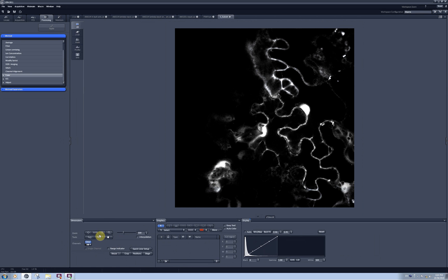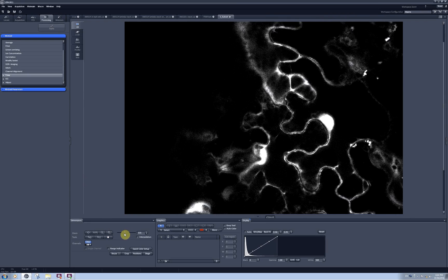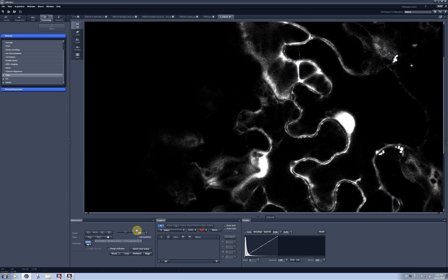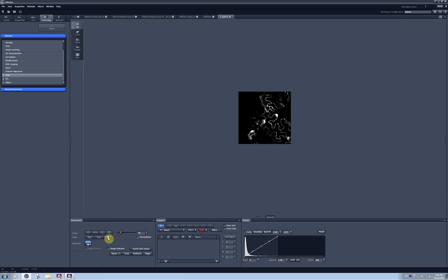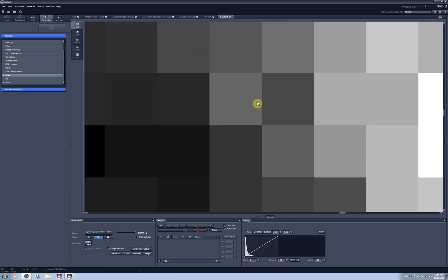The size of the image will depend on the resolution of your scanning. You can zoom in and out using these tools or by scrolling the scroll bar. Alternatively, you can zoom in on a selected area of most interest — select and then draw a rectangle on your image and you will get a zoom into it.